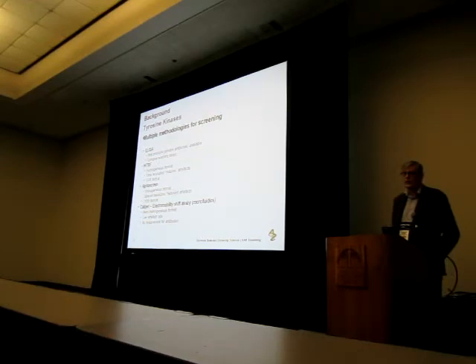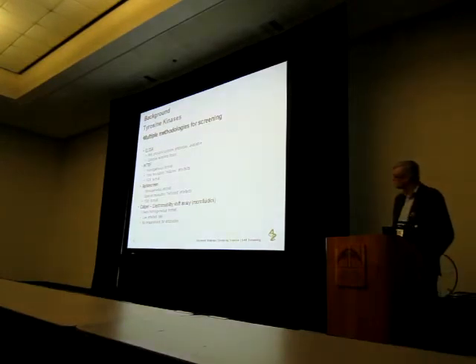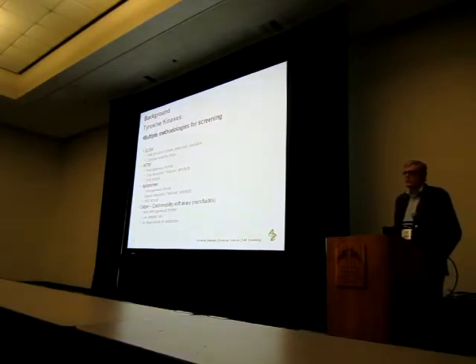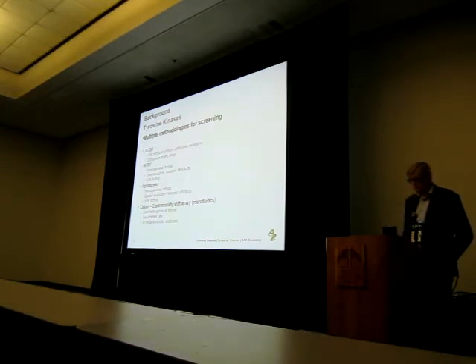But the sorts of throughputs we were getting became quite problematic. We were generating an awful lot of radioactive waste, which isn't pleasant at the best of times. ELISAs, of course, from a tyrosine kinase perspective, there are lots of antibodies available, PY20, those sorts of things. It works. It does work pretty well. The issue really is around the number of washing steps. And of course, because you've got washing steps, 1536 becomes a little more troublesome. So most of the ELISAs that we've ever run at Alderley Park have always been in 384 format.